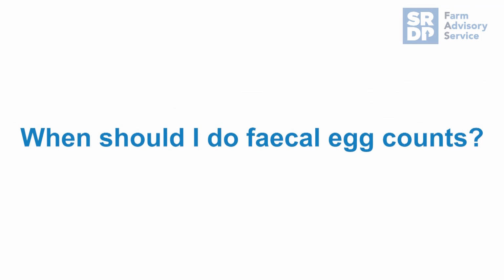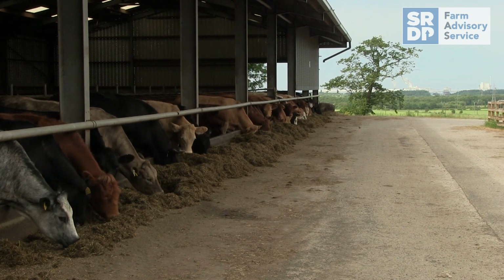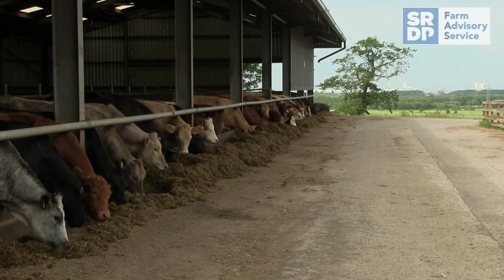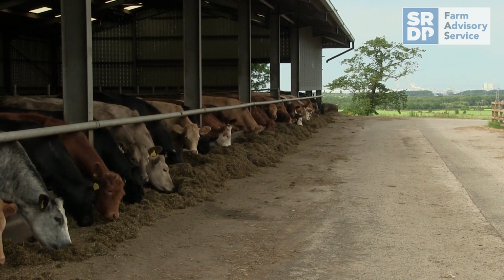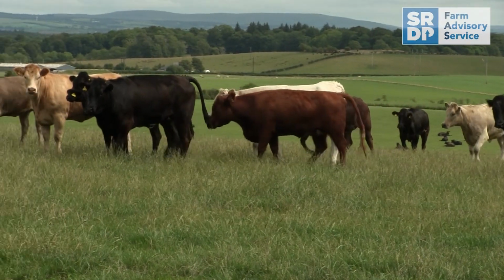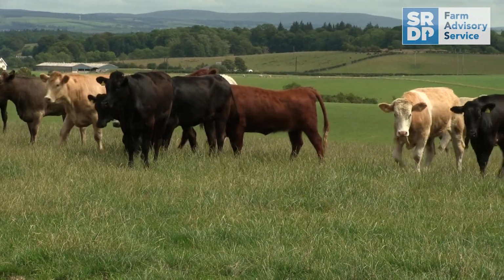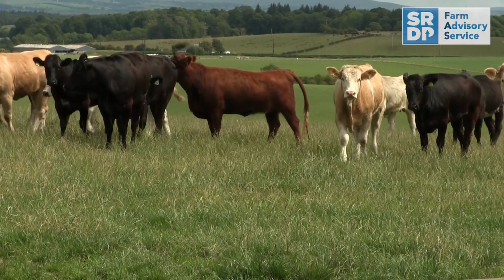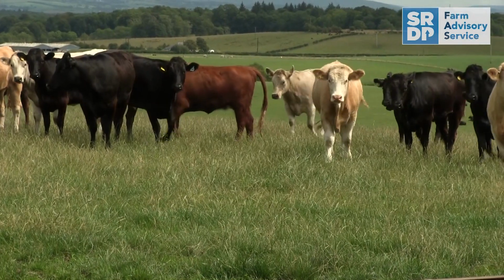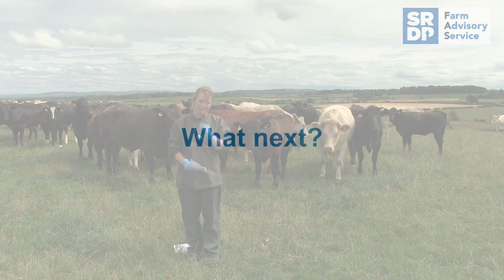You should sample young stock every 3 to 4 weeks throughout the grazing period, and then 3 to 4 weeks after housing. That extends to 12 weeks after housing in the case of fluke. If you're testing to see if anthelmintic treatment has been effective, you should test 2 weeks after using benzimidazoles, macrocyclic lactones or flukicides, or 7 to 10 days after using levamisole.